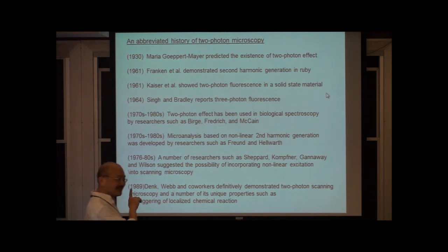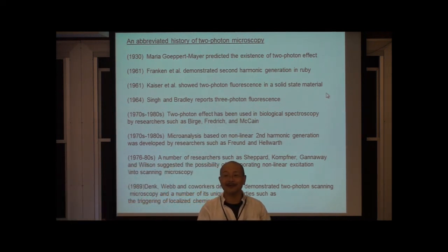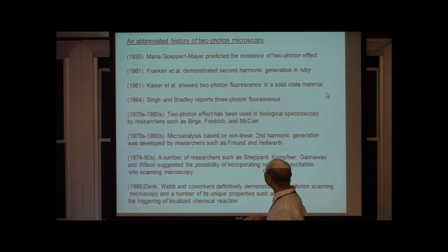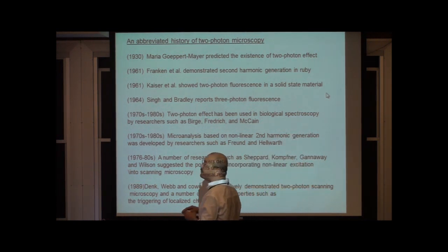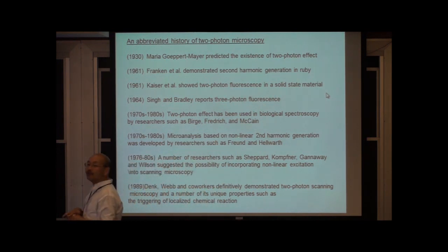But I think this one did make quite a bit of money for some people, although there is a huge legal case associated with it. But around the 1960s, there were a number of experiments that showed that two-photon excitation or related processes are possible, and experimentally demonstrated it. But no one really used the process for very much of anything until around 1978.